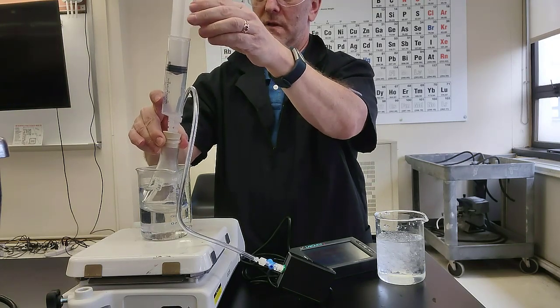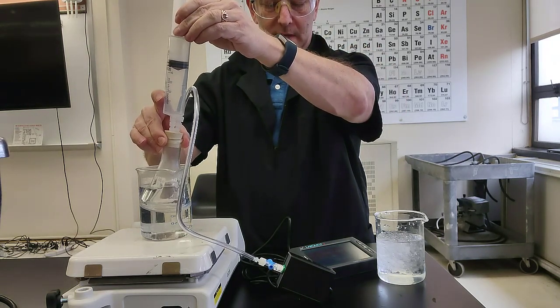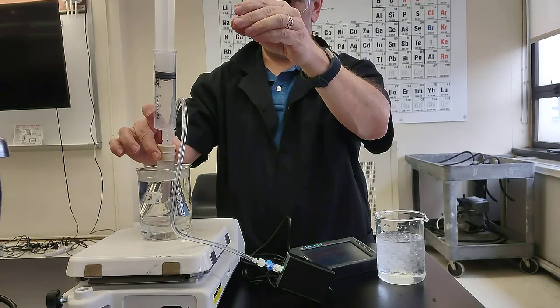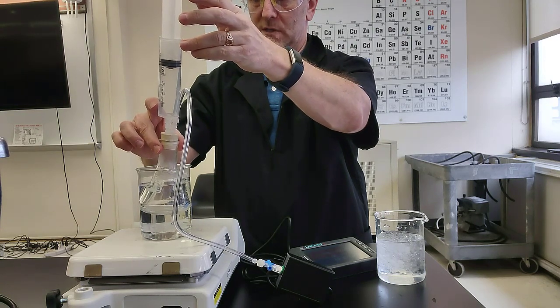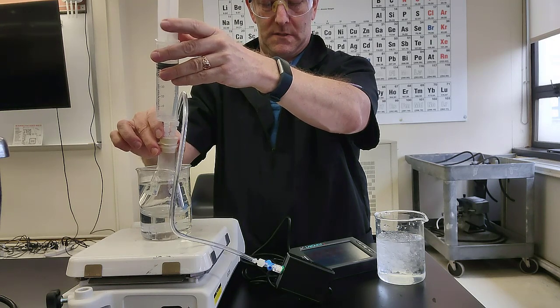Is it not moving well enough? Our pressure is rising, so our pressure really needs to be at 1 atmosphere where it was. This is not any fun if I have to move it. It should move on its own. Just don't want it to blow up in my face.